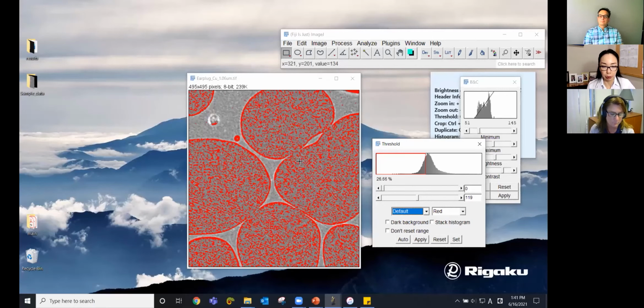And this is where we wanted to ask the next question. Okay, so launching polling again, and the question is, how do we improve these thresholding results? So what could we do? Could we apply a smoothing filter? Could we apply an FFT? Or perhaps could we apply edge detection? We want you to pick a strategy you might try, and then we'll do that.